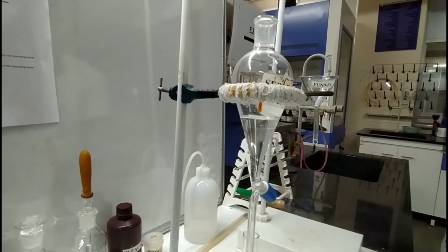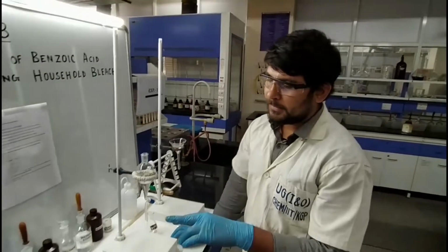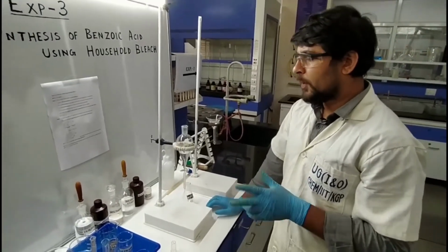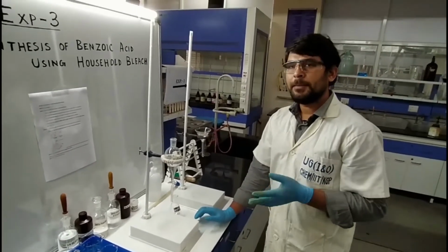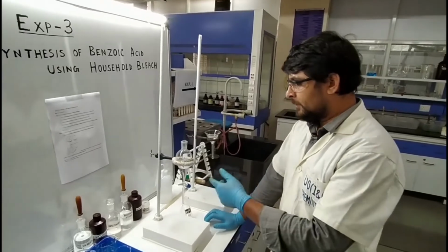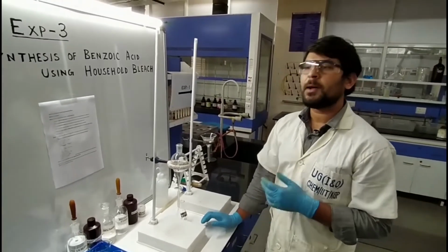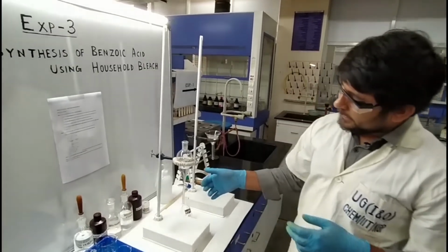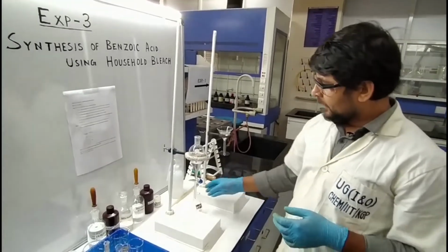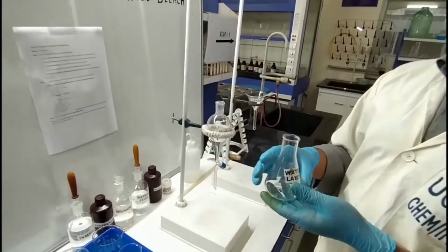Now our intention is with the aqueous layer, because in this reaction the sodium salt of benzoic acid is prepared, and that sodium salt is soluble in the aqueous layer. So we have to take the aqueous layer from the separating funnel into a container labeled as the water layer or aqueous layer.